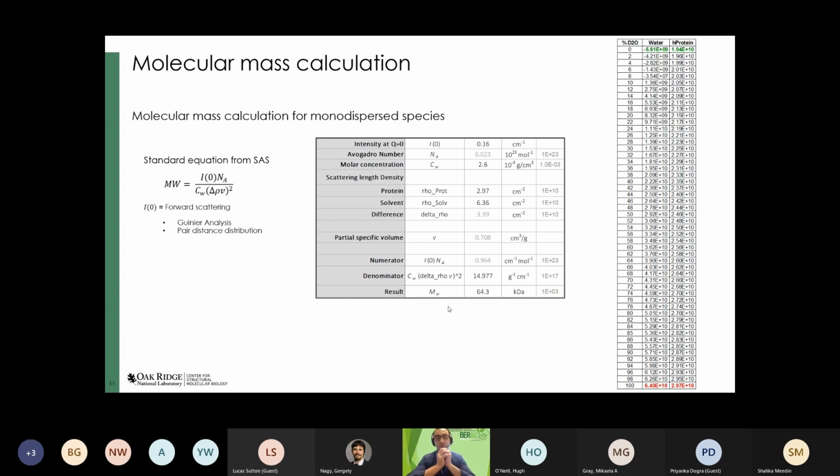Yeah, if you know the SLDs, right? So the composition, the density and the match point will be three variables. If you only don't know the density, then you can get it from the other two. But I think it might be a complicated calculation though, right? Because there's volume, concentration, and then density, the three things you need to know, right?